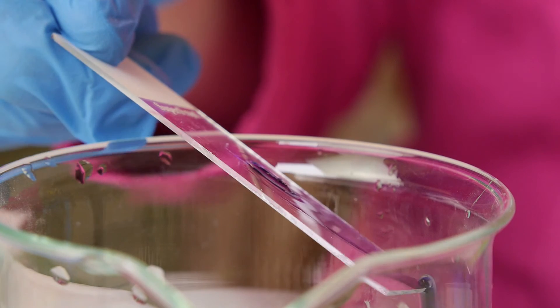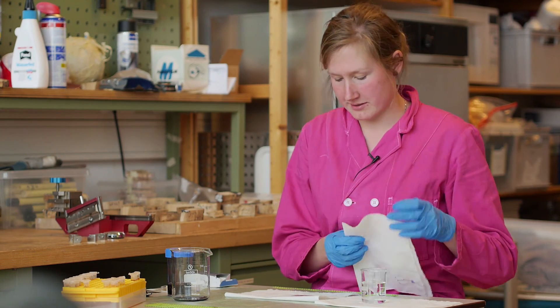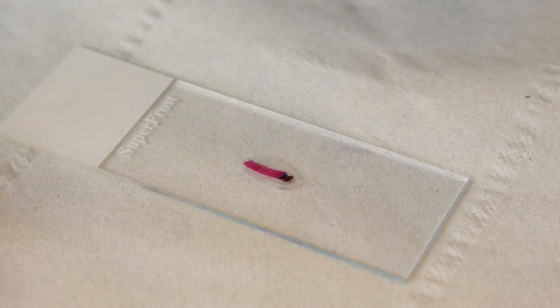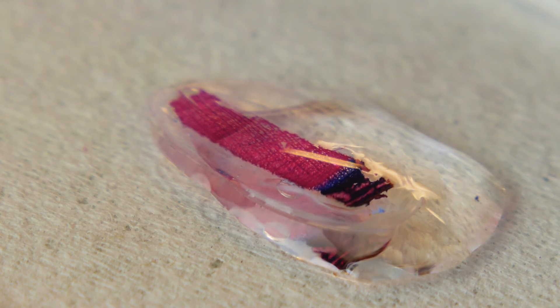Let the superfluous stain flow into the waste jar, and then clean your sample with distilled water just like before. Use a tissue to dry the object holder around the slice. Give a few droplets of glycerol on the slice — often one droplet is already enough. Then cover it with a cover slip. Take care that you do not include any air bubbles on the sample itself.